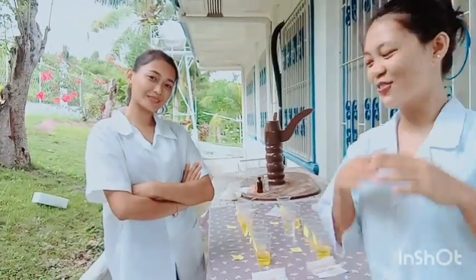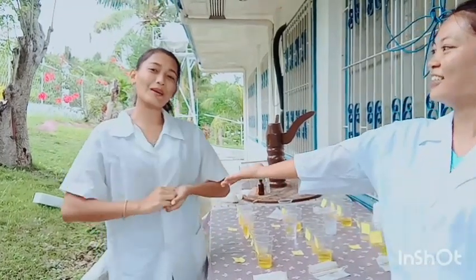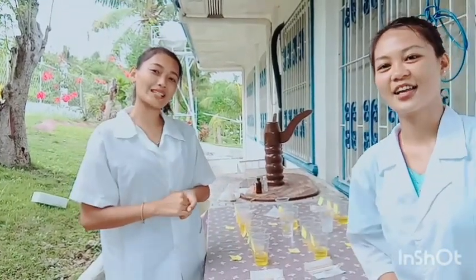So this is the final result of our experiment, which is all about lipids, also known as fats or oils.